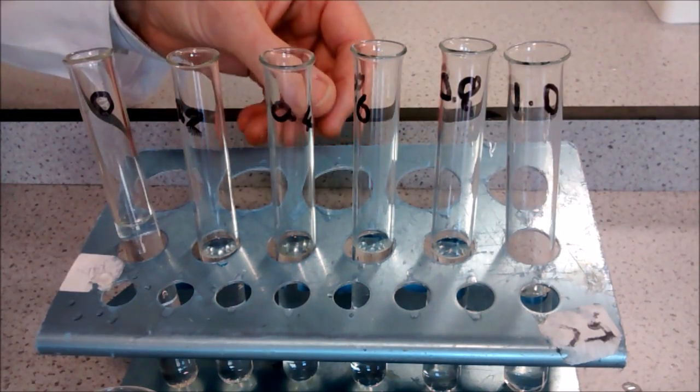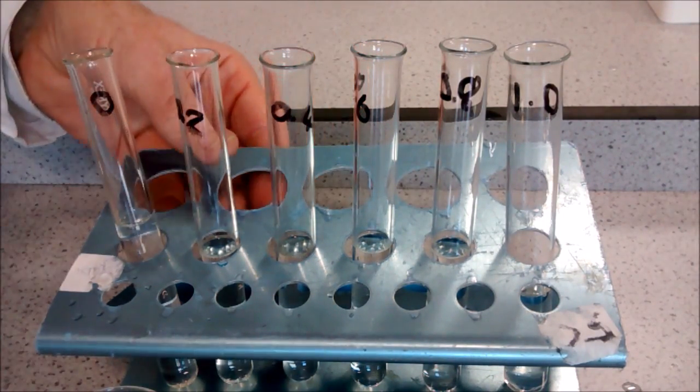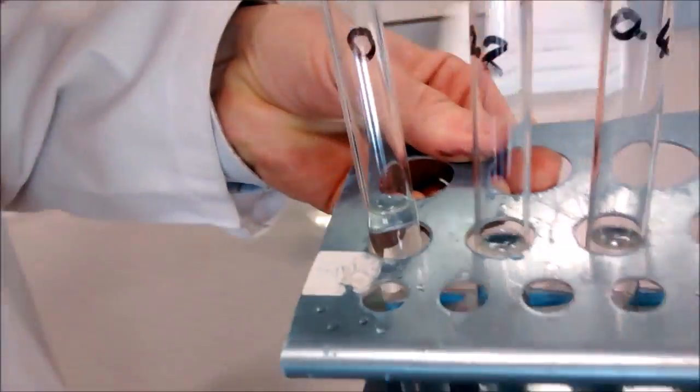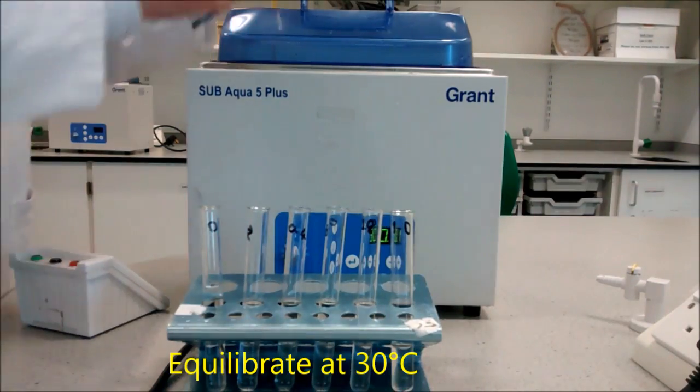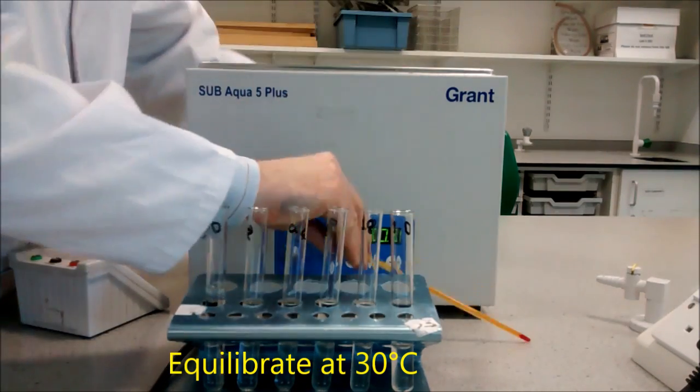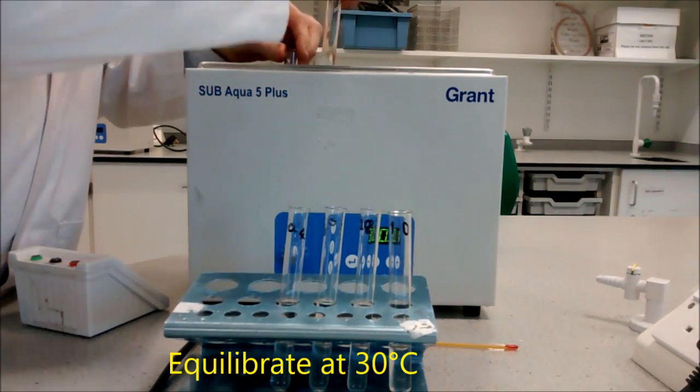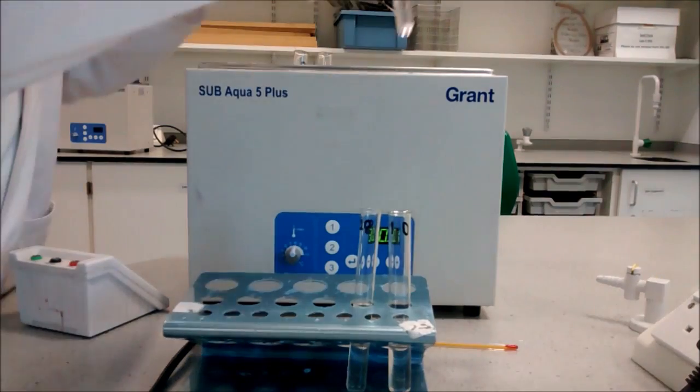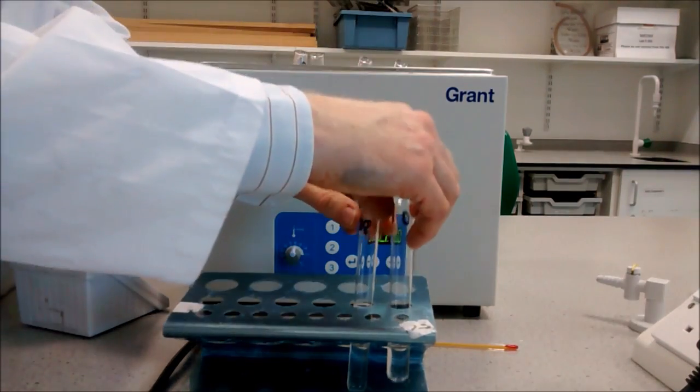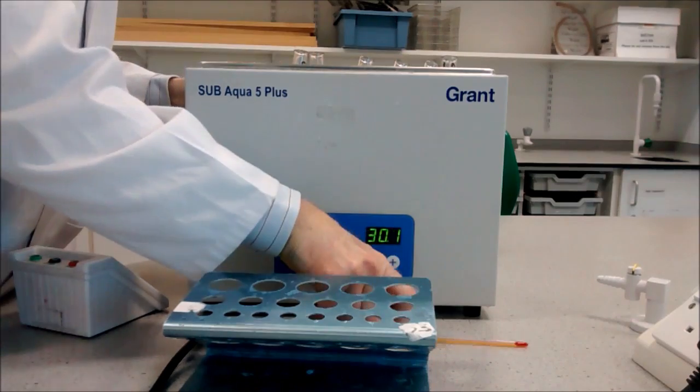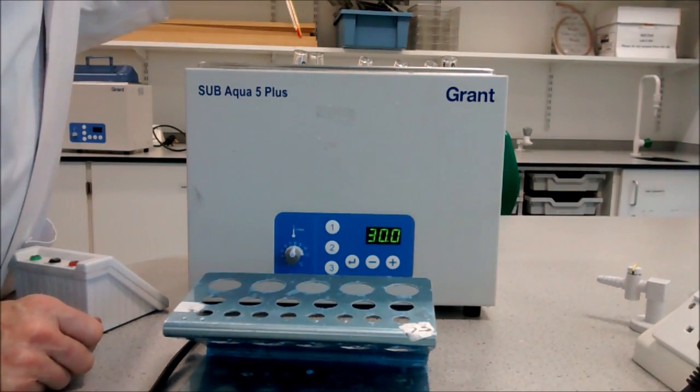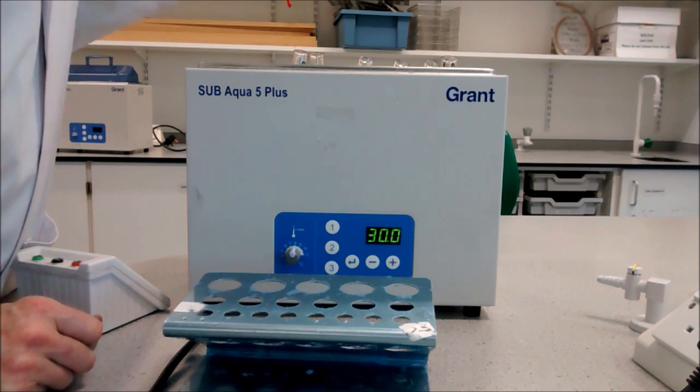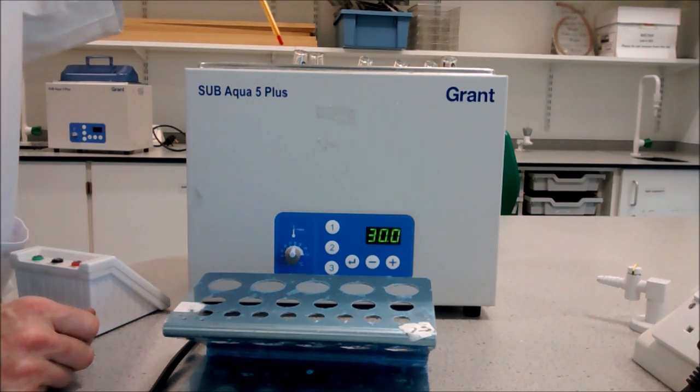These tubes should then be placed into a water bath at thirty degrees Celsius to equilibrate. Put these in: one, two, three, four, five, six. You can check the temperature of one of the tubes. When it reaches constant temperature, you'll know it's ready to use.